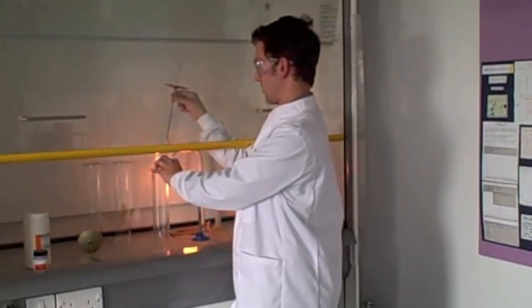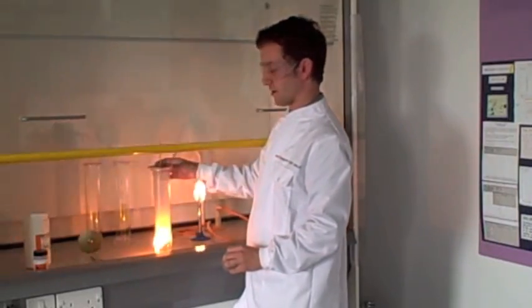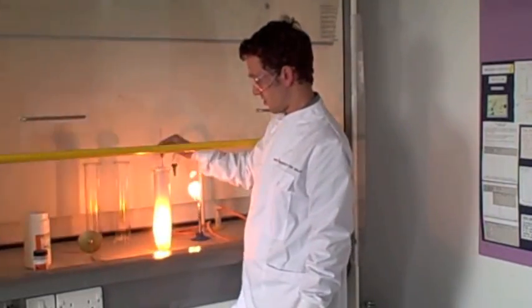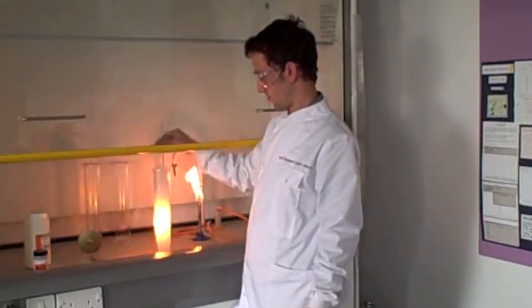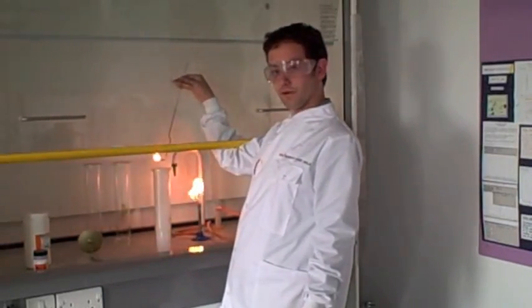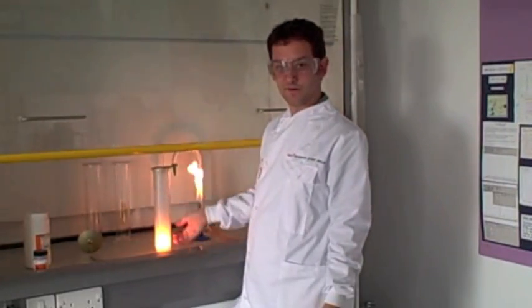Now we're going to see the phosphorus burning in normal atmospheric oxygen here. Yellow color. As I put it into the oxygen, it really accelerates the reaction. It gets hotter and then that makes the reaction faster. And then that makes it even hotter. So in the oxygen, you take it out. You can control the rate of reaction in that position.